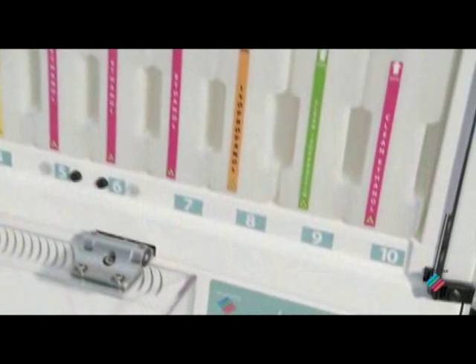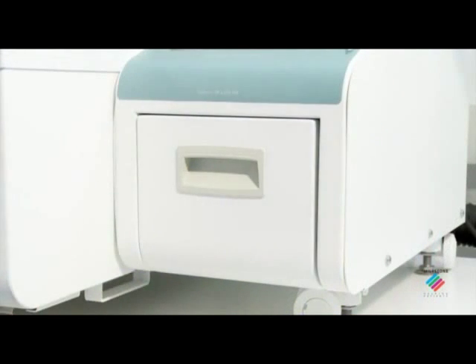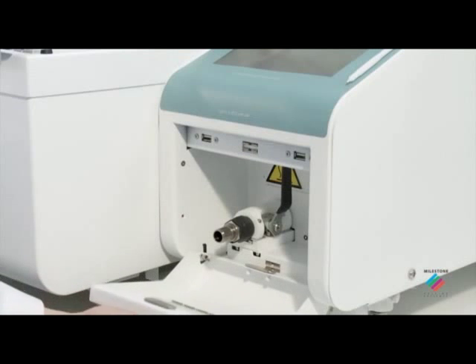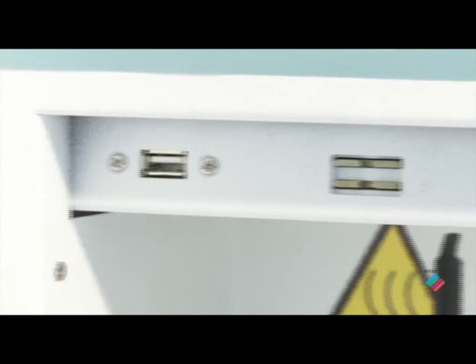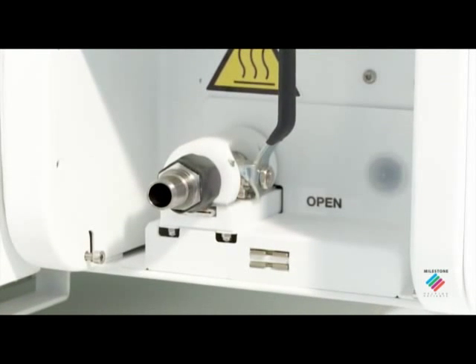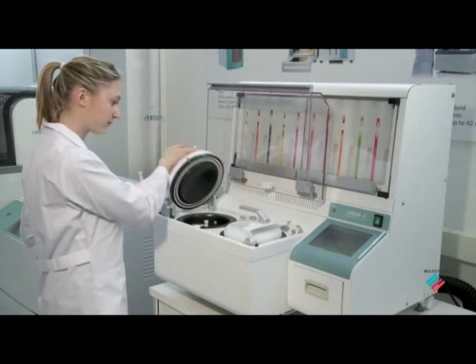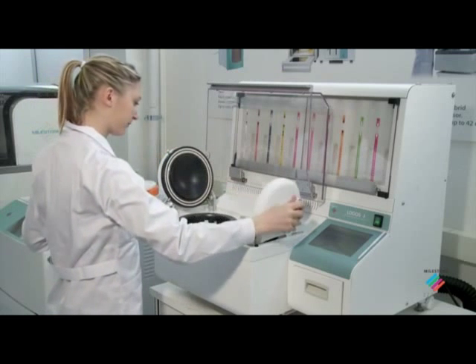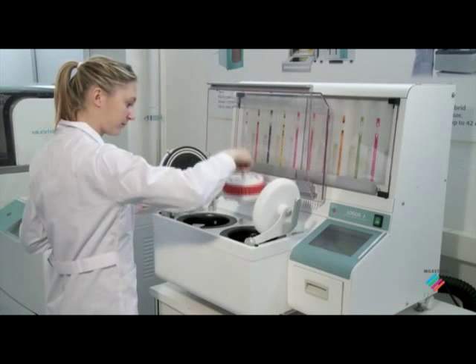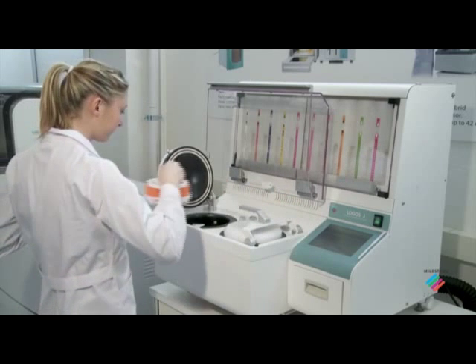Implementation of the lean lab requires optimized dedicated instrumentation, enabling flexible handling of specific work stream needs. Logos J is a new lean tool which allows rapid processing of biopsies up to three millimeters in thickness, leveling out the workload by running small batches of dedicated types of tissues.